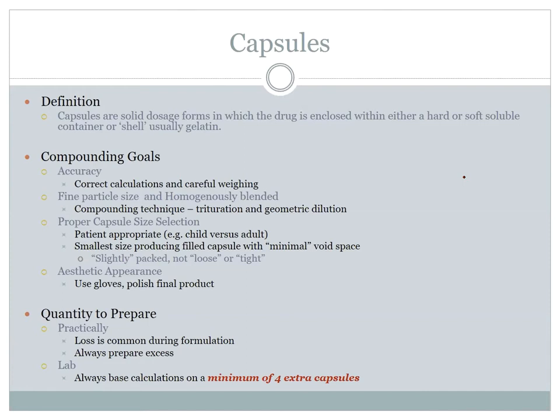They're a mixture of drug plus some diluent. For example, today you're going to be using lactose for your diluent. That's because you need to have enough powder to even just be able to hold, or in your case today, to be able to fill a capsule. You have to fill a capsule slightly packed, meaning mostly full. So the active drug wouldn't be enough powder to do that. So mixing the little bit of active drug with a lot more diluent is absolutely essential. If you don't mix it correctly, then one capsule has 1 milligram and another capsule has 10 milligrams. That would be no good. And you'll see today, you'll use food color to visualize this homogeneous blending.